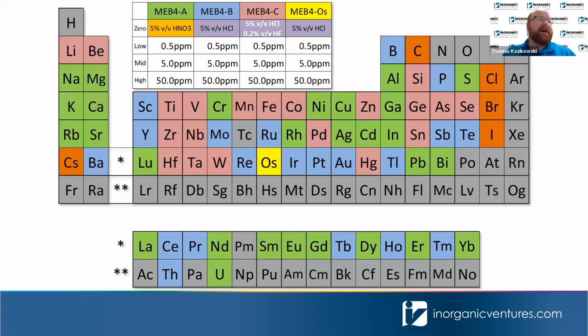So this one is probably the slide everyone's been waiting for. This is our calibration standards. So we've got 3 major sets, the A, B, and C. And then we have that 4th set, which is just osmium by itself. As Mike stated, we don't do rubidium and osmium very often. And with osmium, there's different safety implications in play. So if we have a day where osmium comes through, it's definitely not every day. It might be once a week or so.